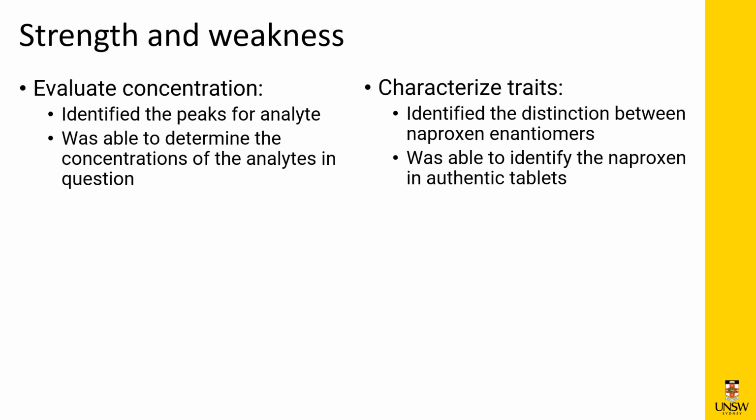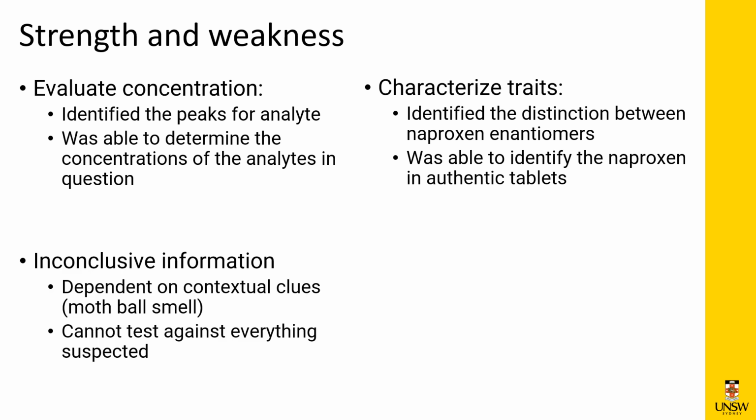More importantly, when there are impurities, HPLC can distinctly separate it from the other analytes in question, and the mass spectrometry is able to make a distinction of what it may be. However, this is simply only due to the context providing directions, where characterizing other compounds within the sample without context clues is difficult. For example, naphthalene was initially guessed to be the filling ingredient, however, without being clued into the smell, characterizing naphthalene would have been difficult, as noted with aspirin.